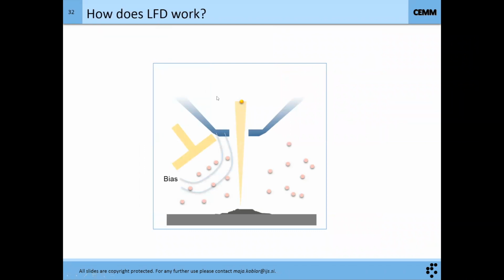The large field detector and the low vacuum, how does it work? Your primary electron hits your sample, and because you have gas molecules, you cannot use the Everhart-Thornley detector because it would arc over. But your secondary electron is still generated. You apply a bias potential, so you attract those electrons. Because they ionize your water molecules really quickly, you get an ionized molecule and an additional electron.